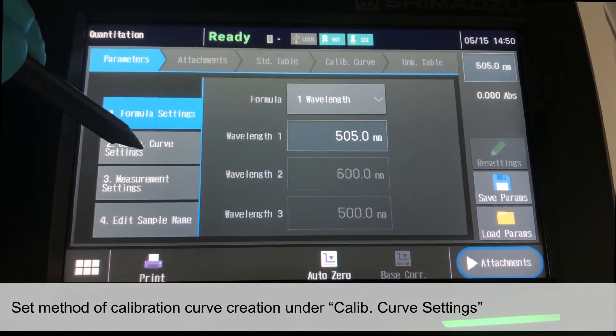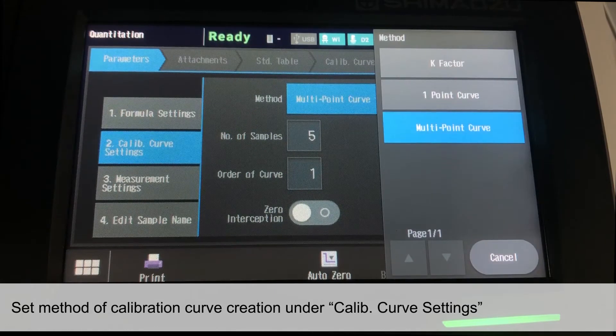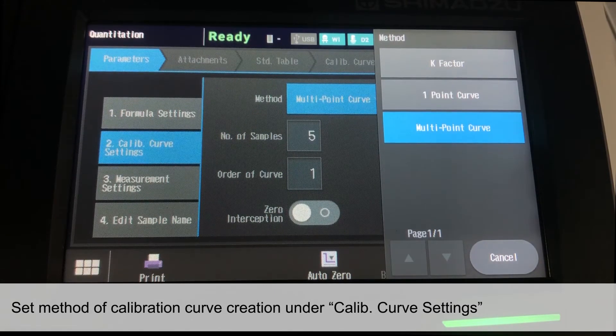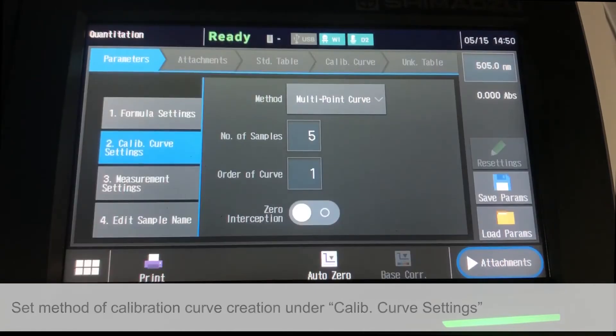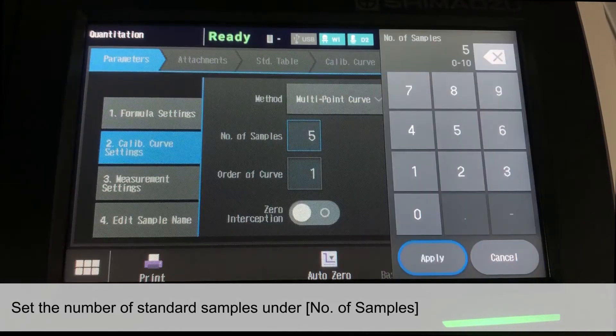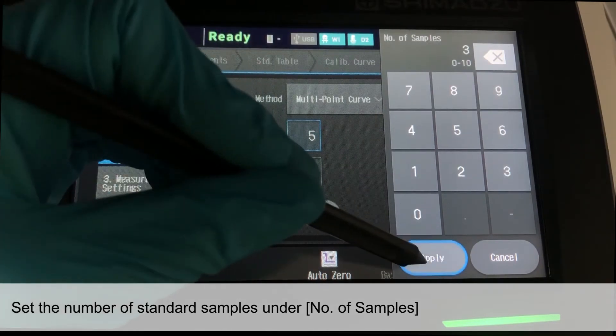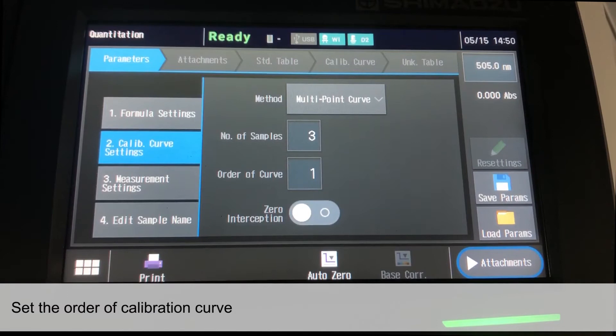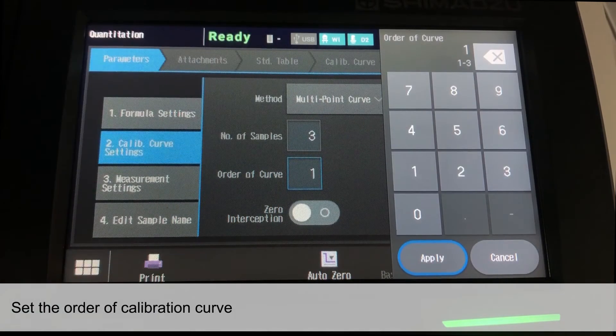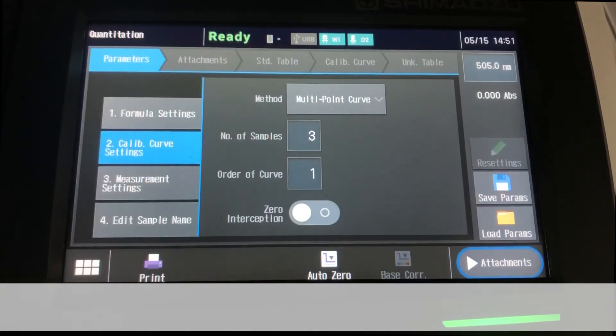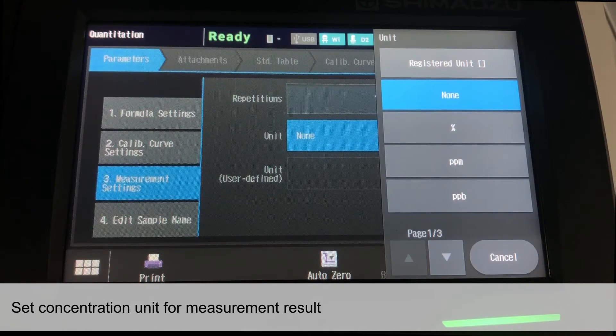Under Calibration curve settings tab, set the method of calibration curve creation. Normally, multipoint curve method is used, so this is used as an example. Set the number of standard samples for calibration curve creation under Number of samples. Set the order of calibration curve. One is selected which represents a linear curve. Select the concentration unit for measurement result.